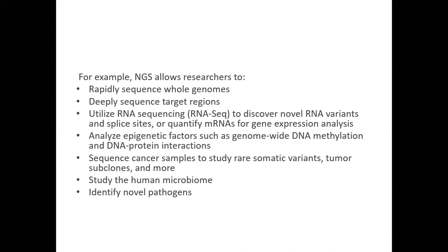At the same time, we can also use it to study the human microbiome, or vector microbes. And maybe if we're lucky, we can also identify a novel pathogen with NGS.